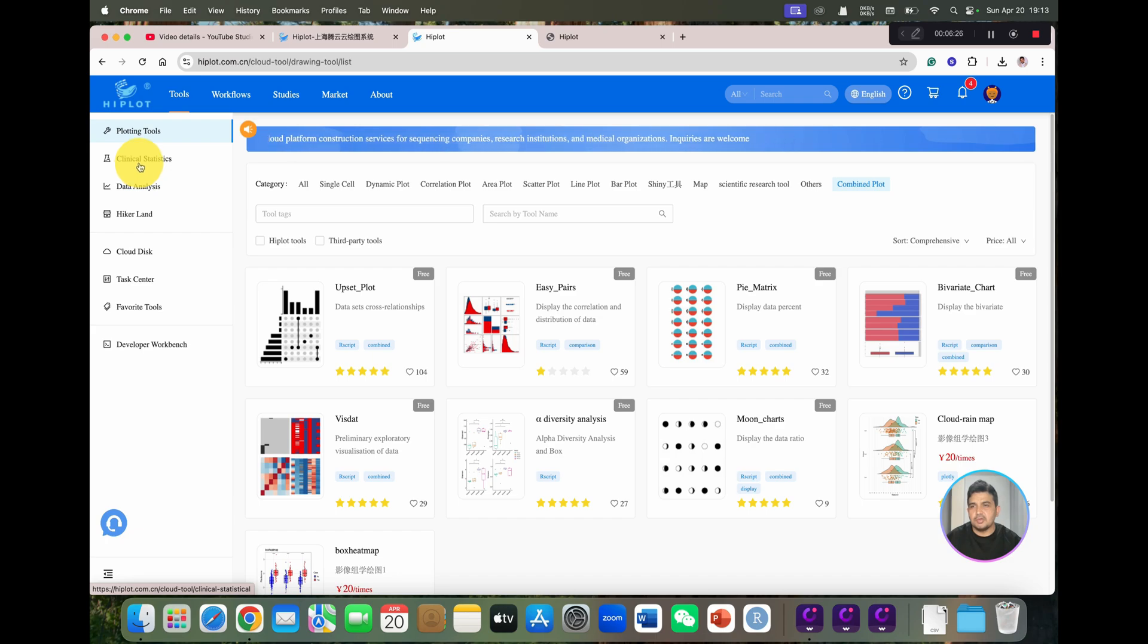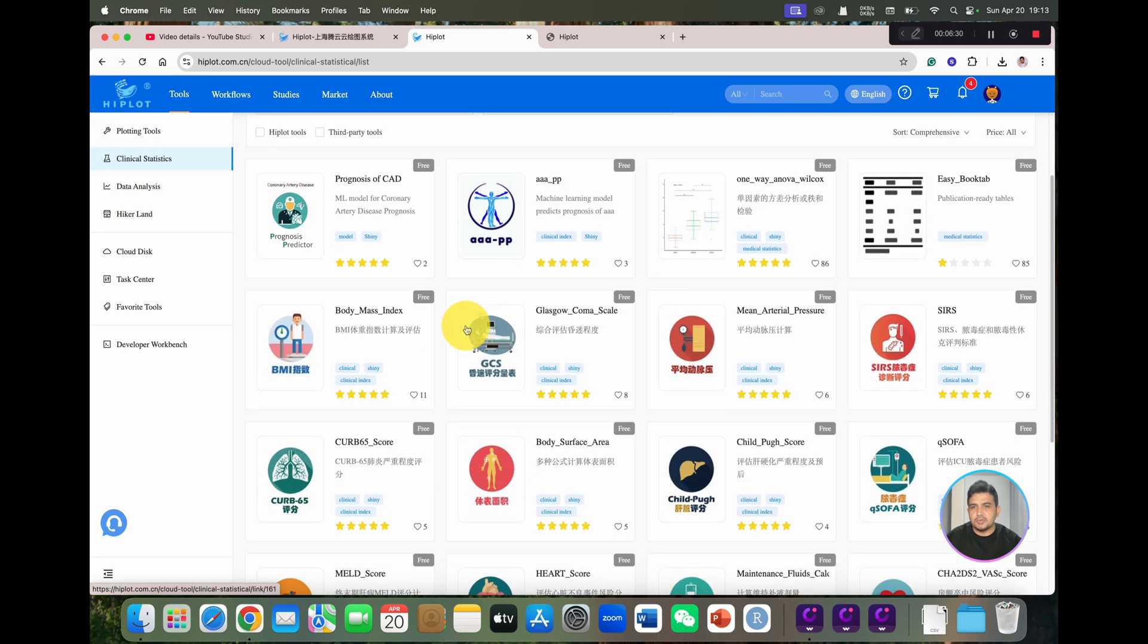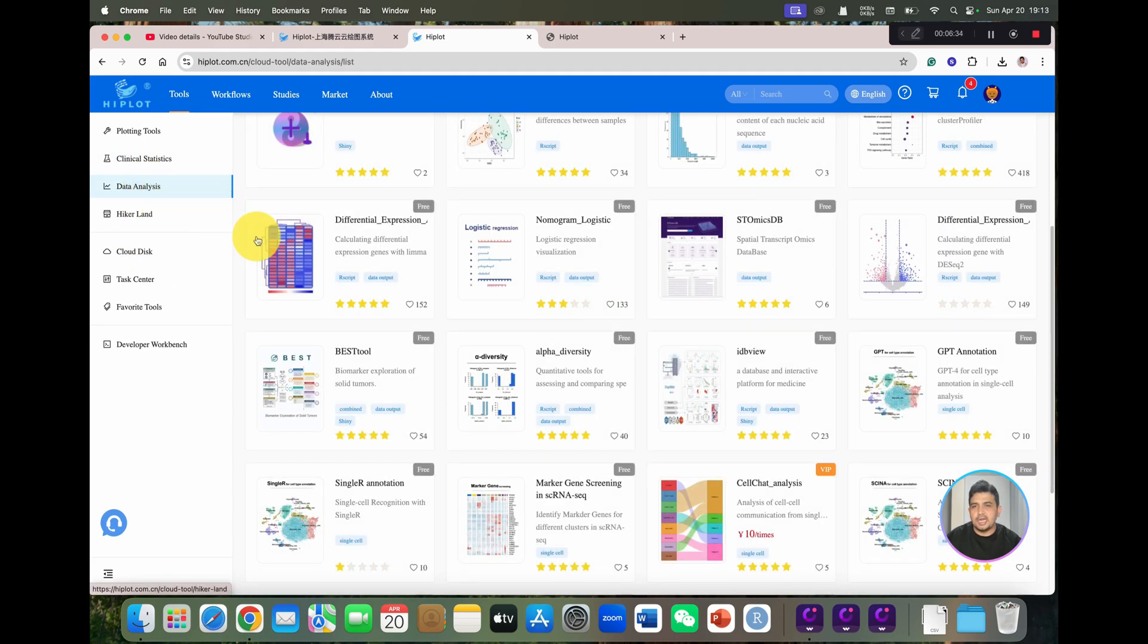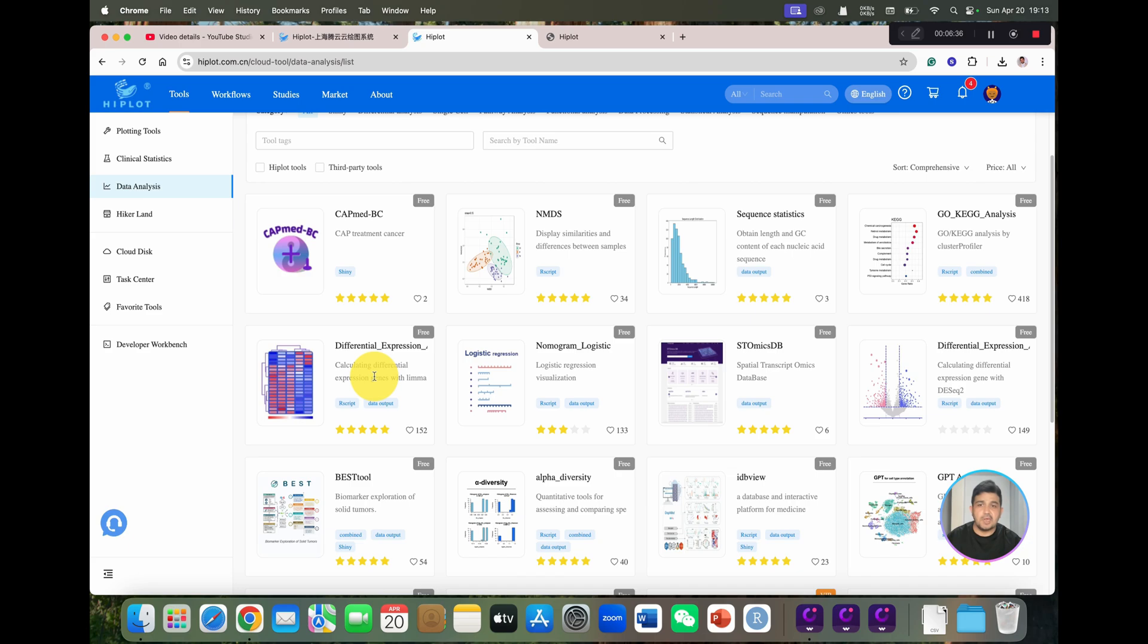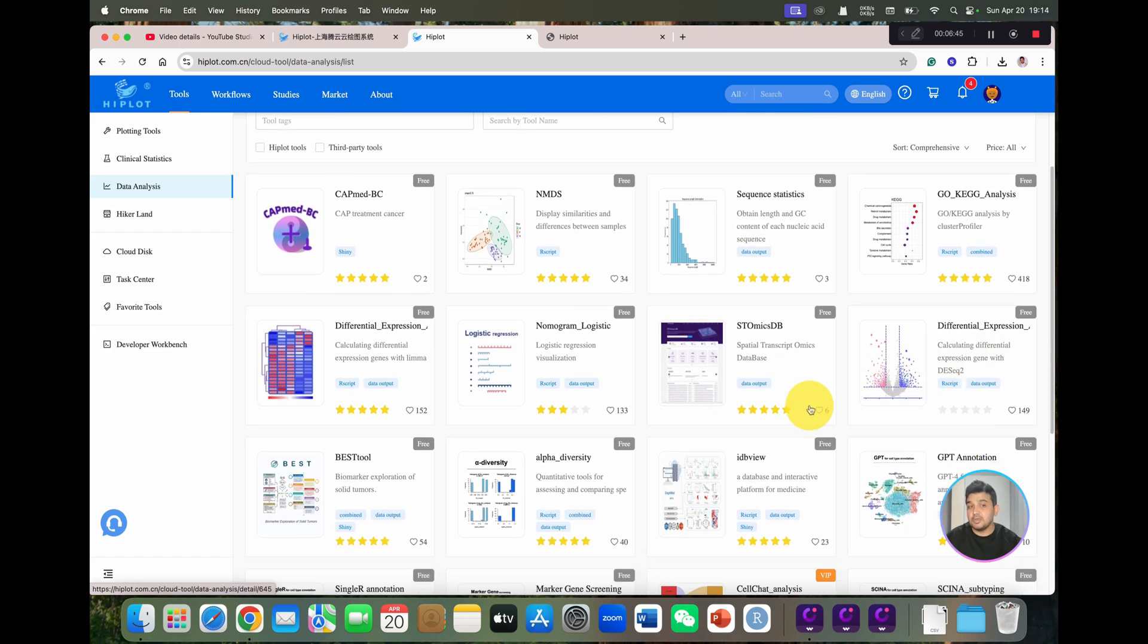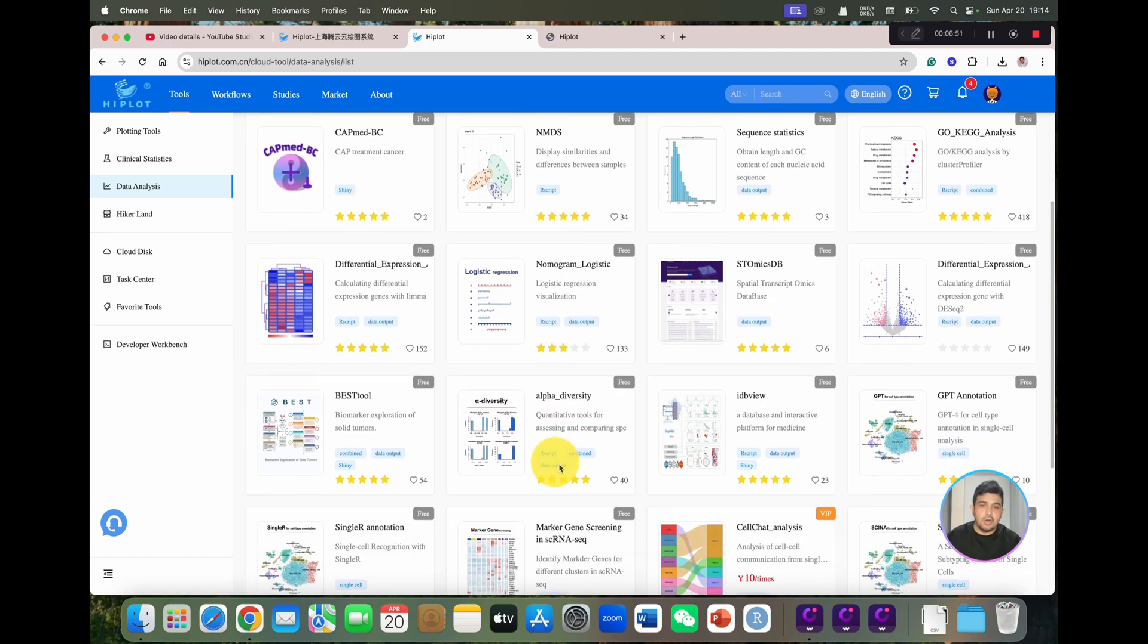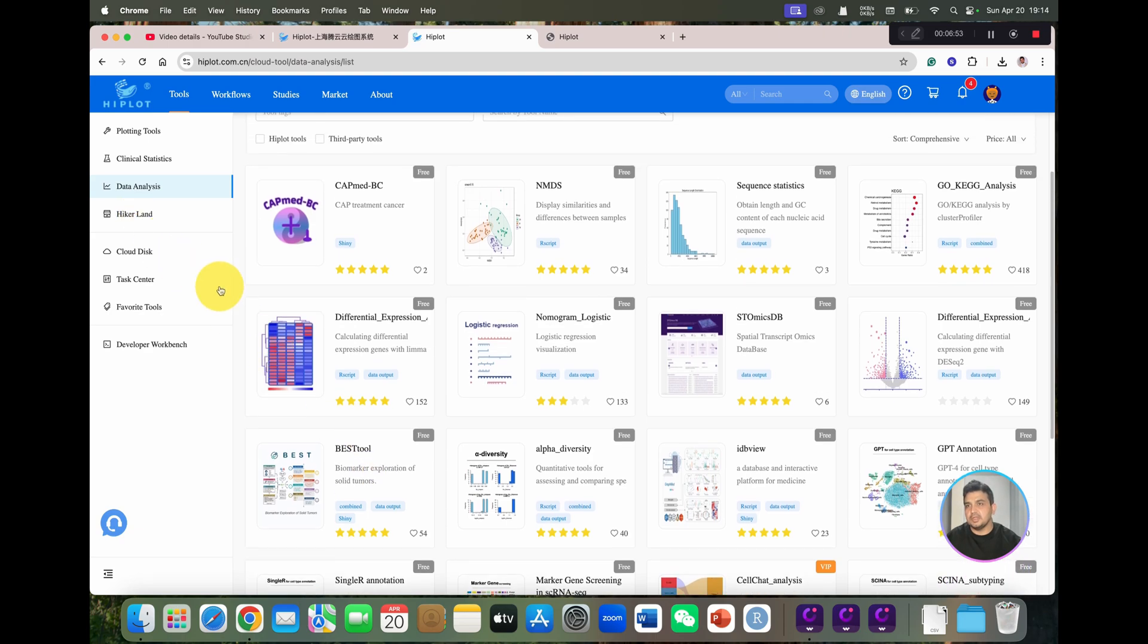Similarly, if you can go into clinical statistics, it will help you to arrange different tools. And we can even do data analysis. Like if you have data and you want to perform DEG analysis or differential expression analysis using DESeq2, it will also help you. If you have your metagenome data and you want to calculate alpha diversity, so all is available within this HiPlot. So I will go back for this introduction purpose.